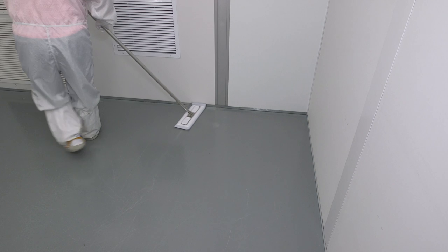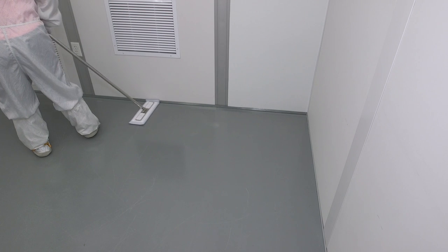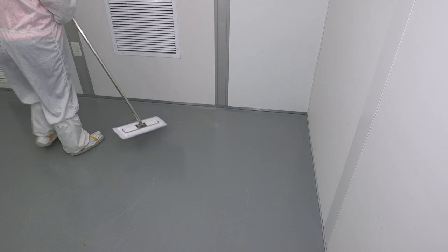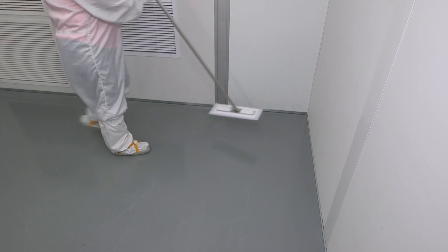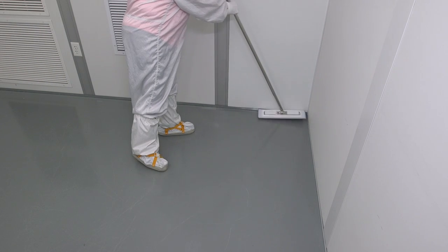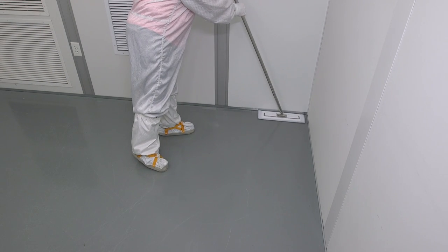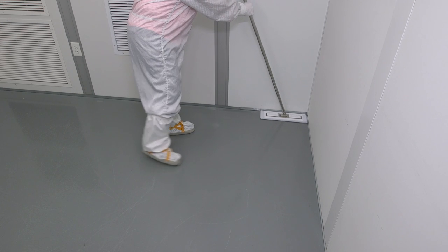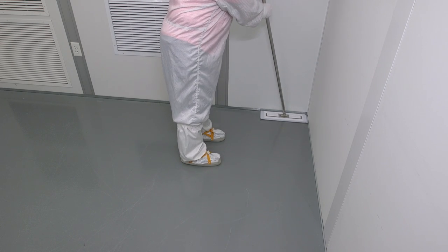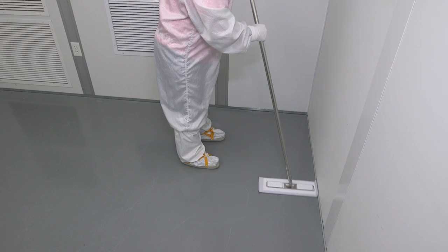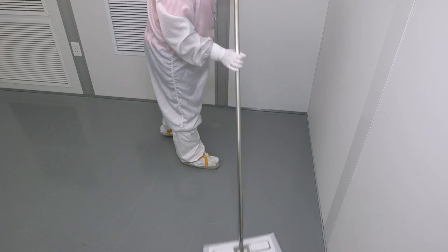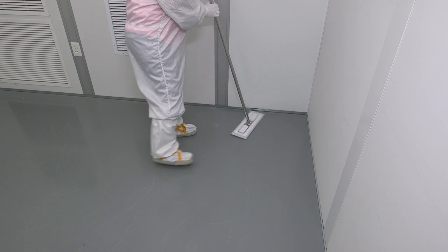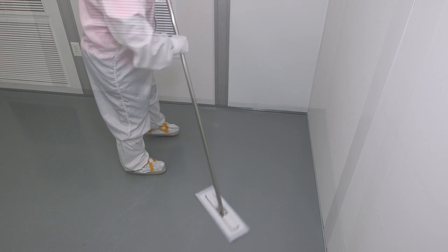Another method commonly used for cleaning floors is the S-curve method. To perform the S-curve method, starting at the corner furthest from the entryway with a damp mop, make your first pass along the wall edge.